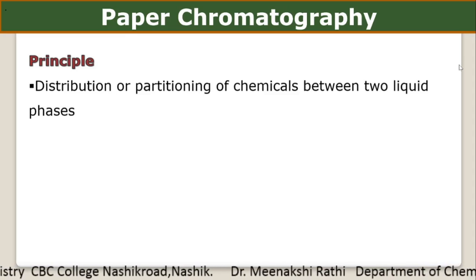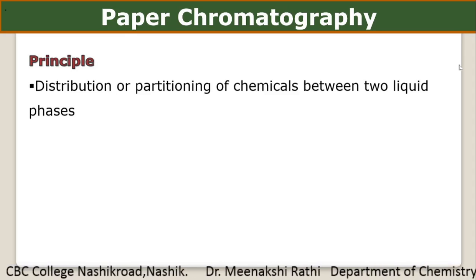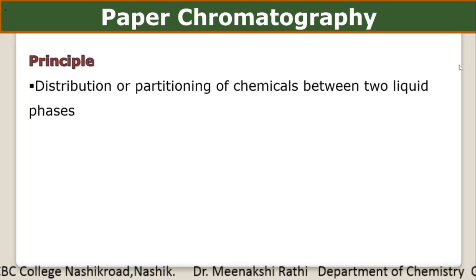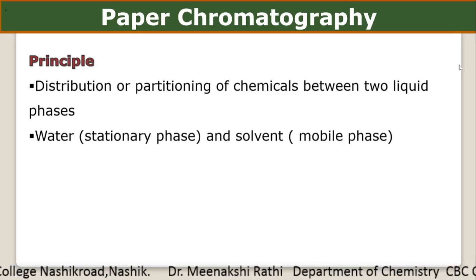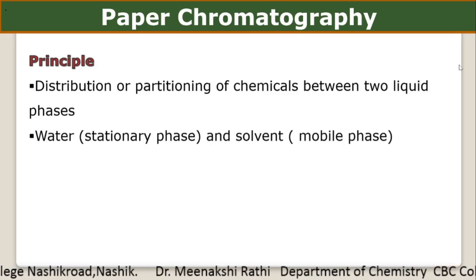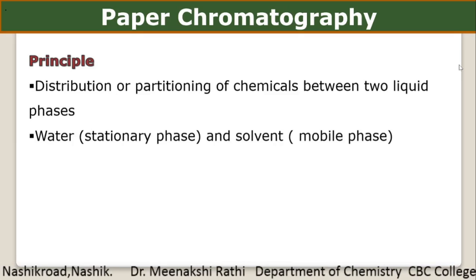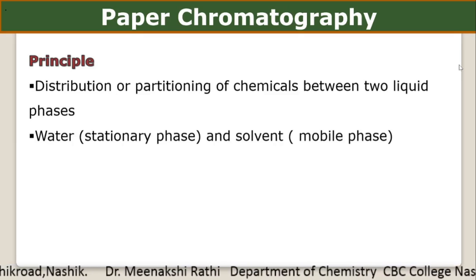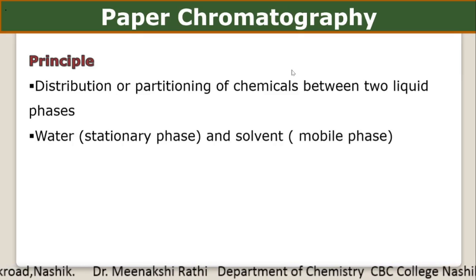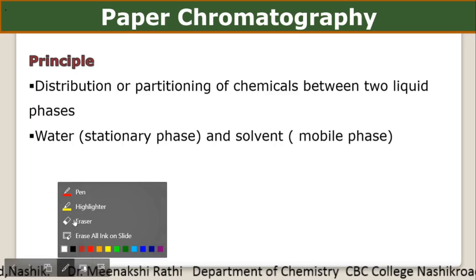But still it is called distribution or partitioning of chemicals between two liquid phases, because one phase is the water, which is held in the small pores of the filter paper, and that water is considered as the stationary phase.